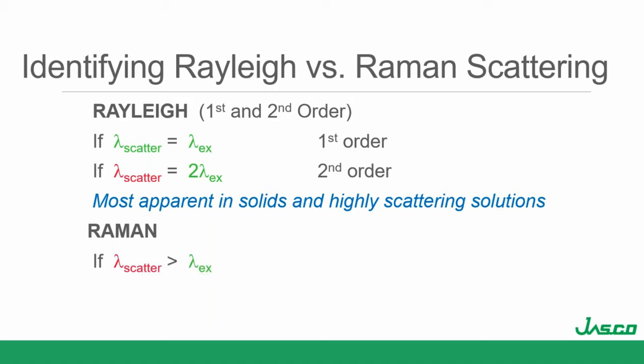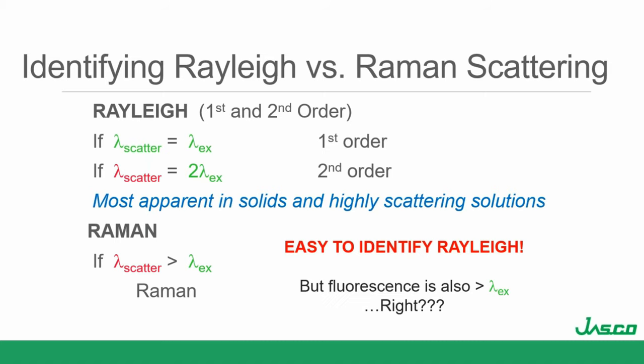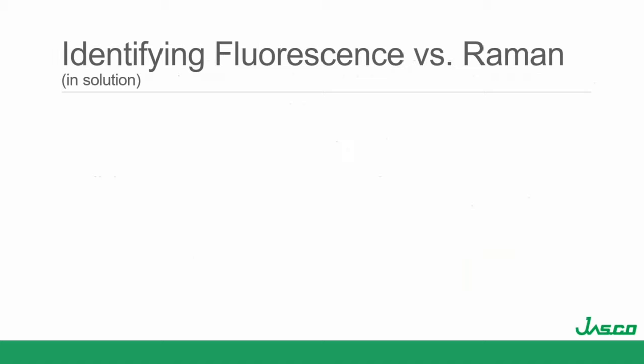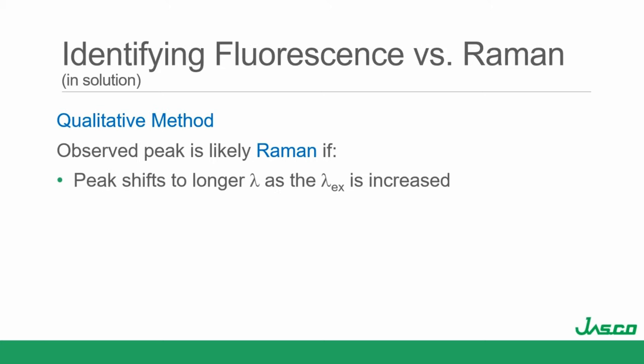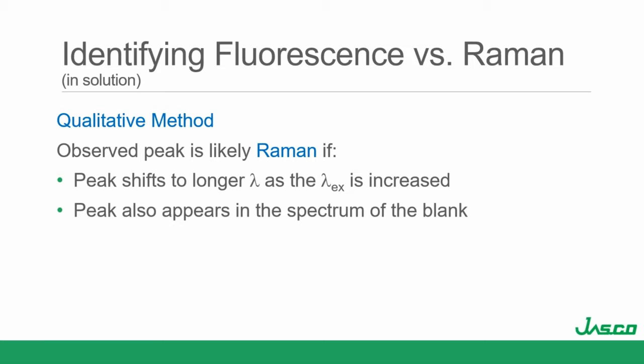Raman is going to show up at longer wavelengths than the excitation band. A more important question is: how do you tell if it's fluorescence or Raman? A quick qualitative check: you can tell the observed peak is Raman if the peak shifts to longer wavelengths when the excitation wavelength is increased. The peak also appears in the spectrum of the blank — if it's just the solvent, you shouldn't see a fluorescence band. So the easiest thing to do is run emission scans at different excitation wavelengths for both sample and blank.